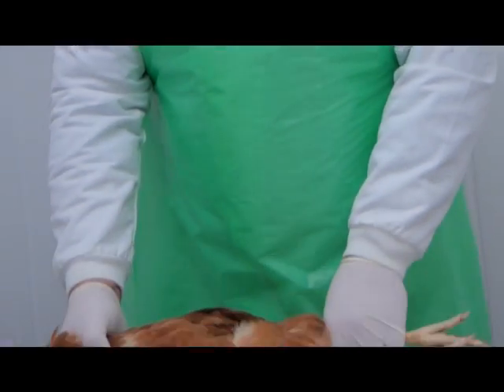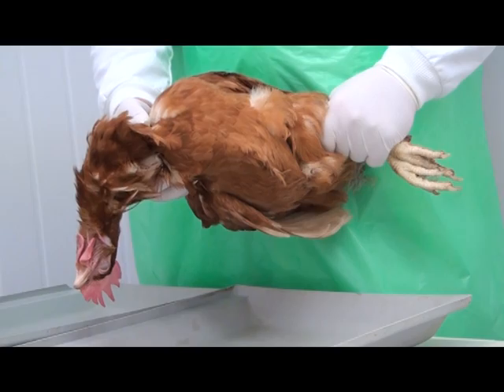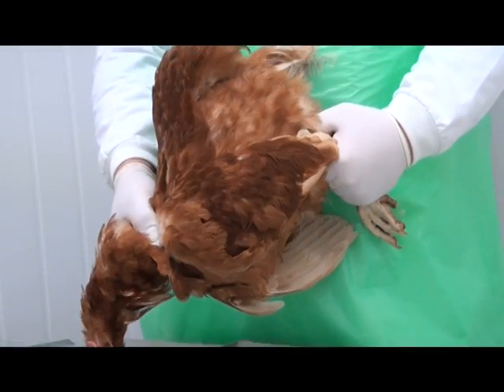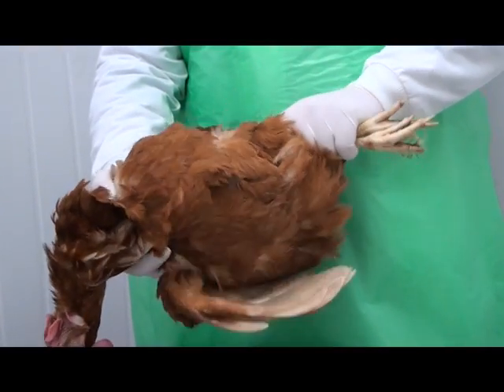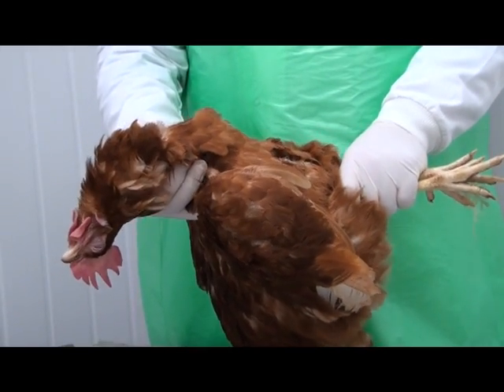We're now going to go on to the dissection of the bird. The bird that we're using is a bird that's come to the end of its productive life and was going to be euthanized. It is a brown laying bird, standard breed for the UK producer.